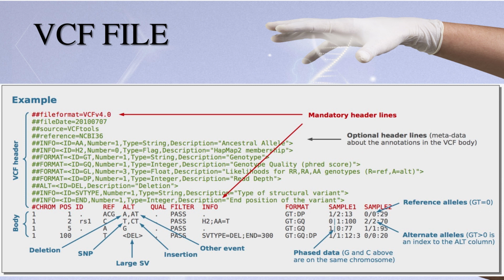This inclusion allows understanding the insertion's position in comparison to the reference sequence. It's important to note that the bases reported in the ref and alt columns are consistently provided on the forward strand. Moving on to the subsequent columns after reference and alternate, we encounter the quality column. The values in this column represent probability values estimating whether the variant call at that site results from sequencing error. For instance, a value of 10 suggests a 1 in 10 chance that the called base is not a variant but rather a result of sequencing error.